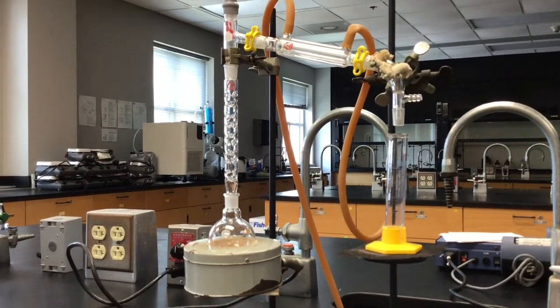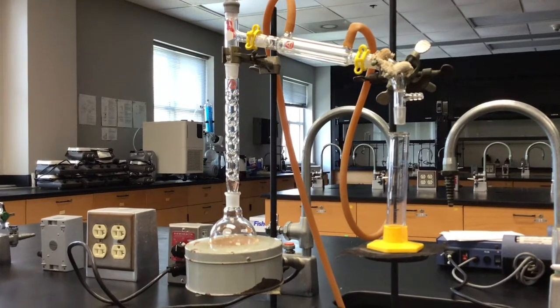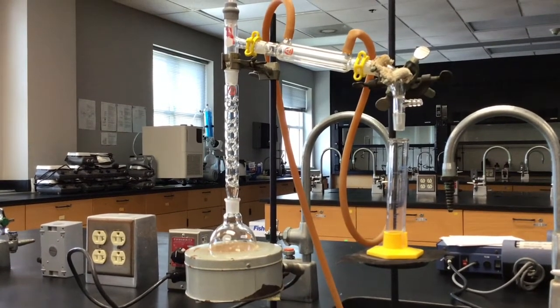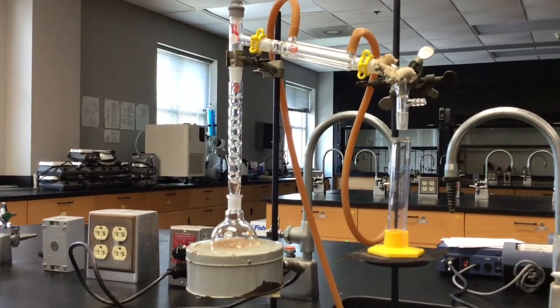Dr. Hamilton or one of the TAs will check the apparatus before you begin your distillation, so before you start you need to get one of our attention to put it all together, make sure you did everything correctly.